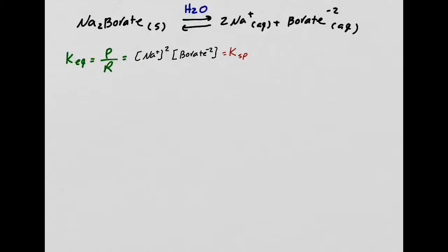Now, the goal is, what we want to figure out is how much of this borate will dissolve. Okay? So we want to figure out how much borate will dissolve.